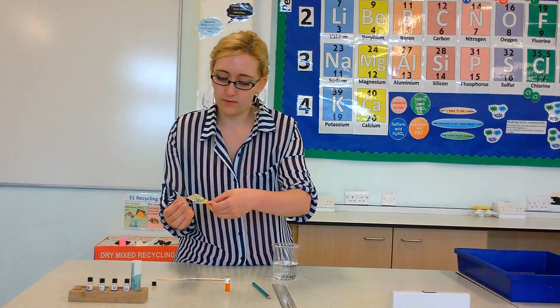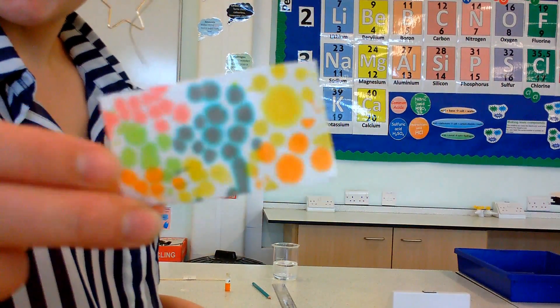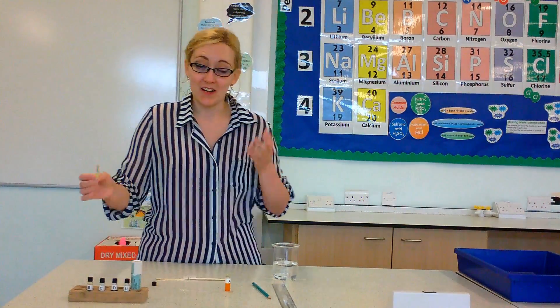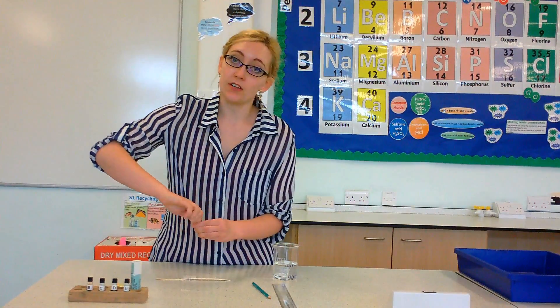Brush it off the side and then you've got another tube ready to put to use. So we can get rid of all of the ink out of our capillary tube and reuse them so you don't have to go through loads and loads of materials. You can also use pens for this - that works just as well.